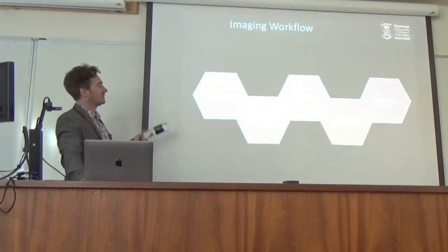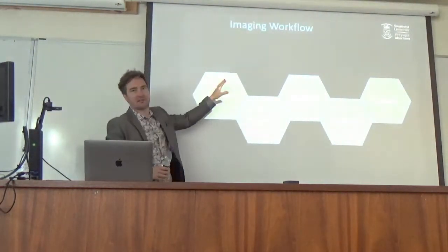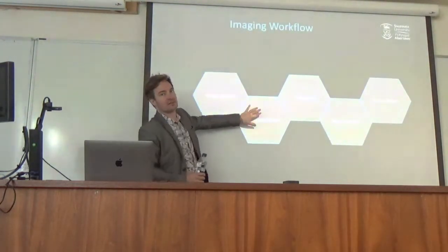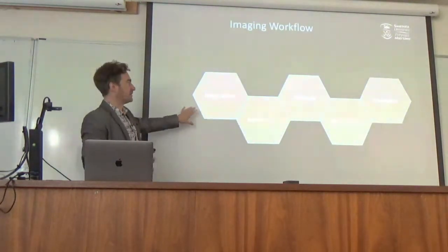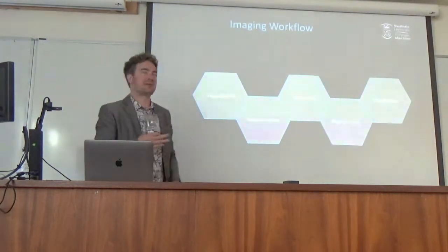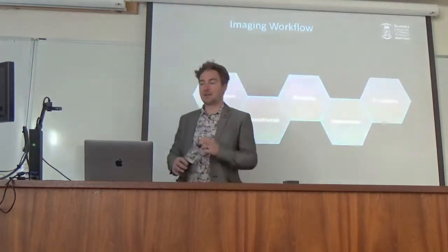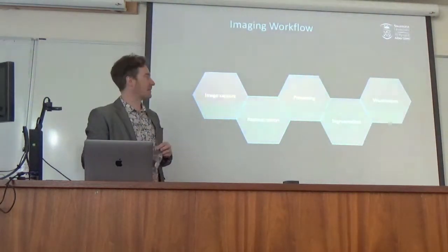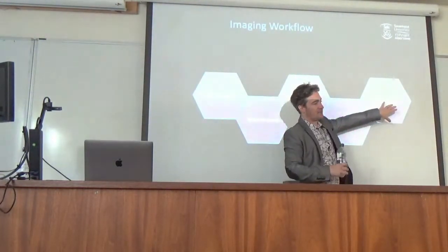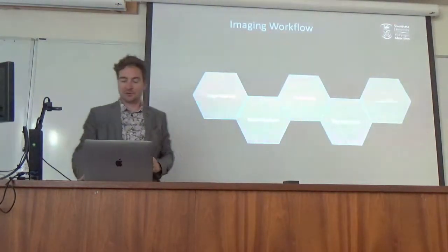At the moment, the workflow or pipeline, whatever you want to call it, for imaging is: we capture, and there's a million things in here that can affect the capture and the quality, but I'm not going to go into those. Then reconstruction, where again, there are very different reconstruction algorithms that can affect the quality of your data. We might process the slice data to try and remove noise and beam hardening and things like that. Then there's this very time-consuming part on some specimens, the segmentation, and then we get to the visualization.